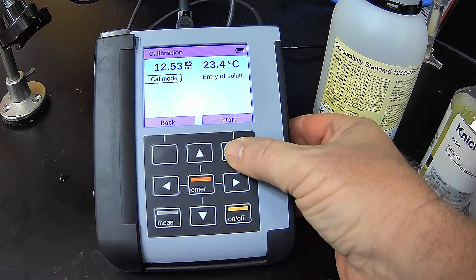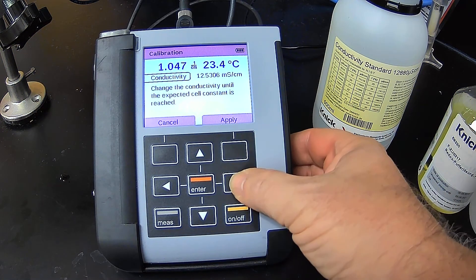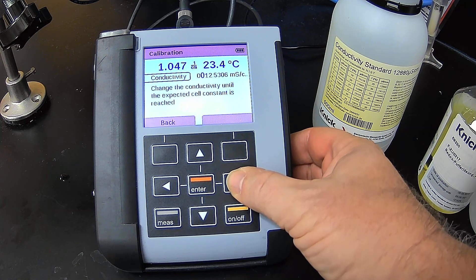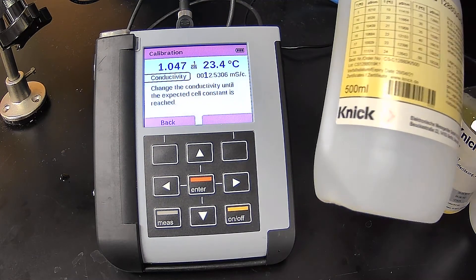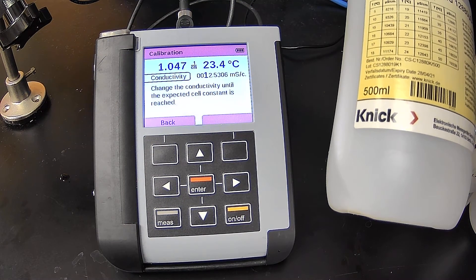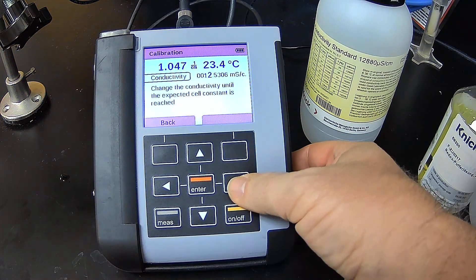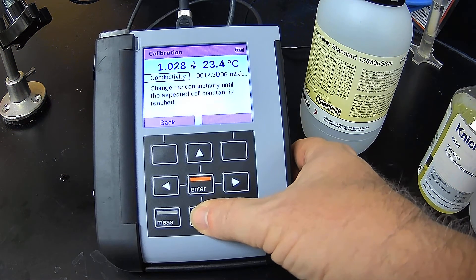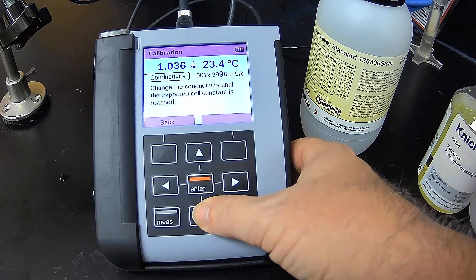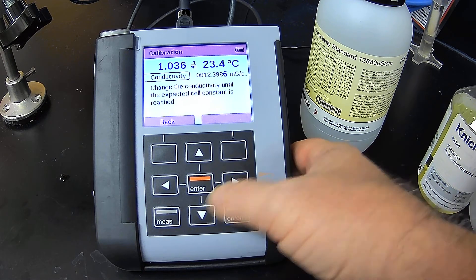And then it asks us for the conductivity solution value. As I said, at 23 degrees Celsius, we're at 12,398. So we're going to put in 12,398.